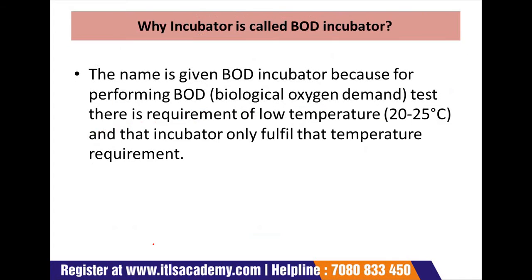Now we will discuss why the incubator is called a BOD incubator. As we know, the full form of BOD is biological oxygen demand, but what is the role of biological oxygen demand in an incubator? Incubators only provide the required temperature for the growth of microorganisms, so there is no relation of BOD with the incubator, yet it is called a BOD incubator.